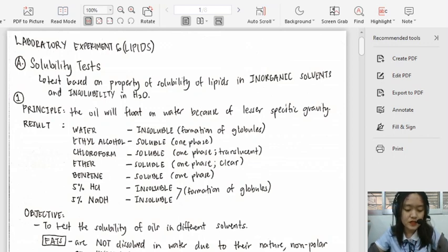This is the basis of iodine number determination, which is a test to detect the degree of unsaturation of fats and fatty acids. The more unsaturated the fatty acids, the more double bonds it has and the more halogen it will absorb. So, kung mas maraming double bonds na present sa isang unsaturated fatty acid, mas marami ring halogen ang kanyang natitake up.